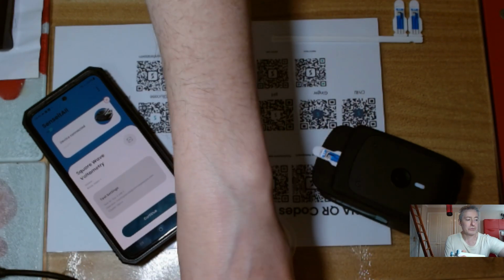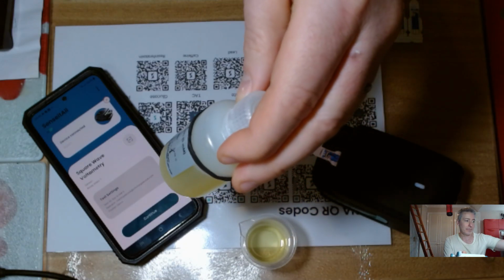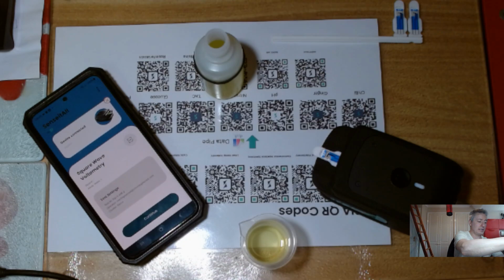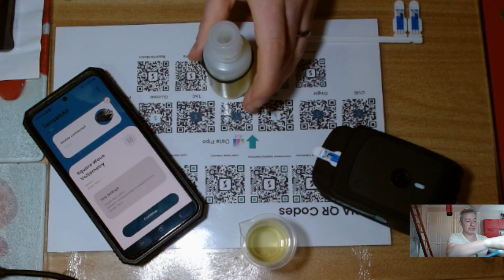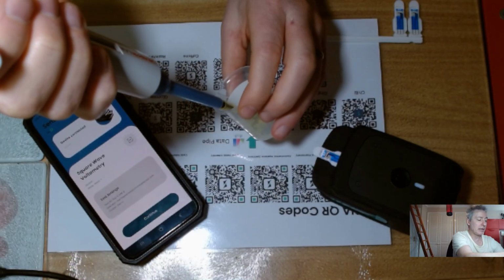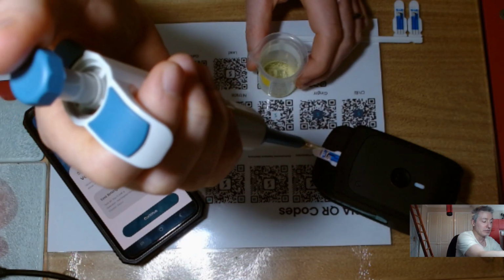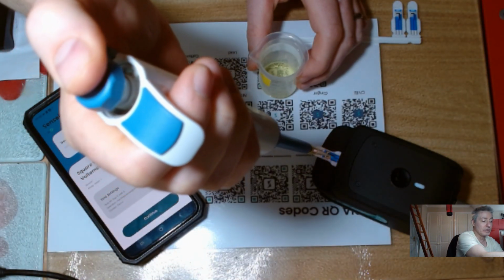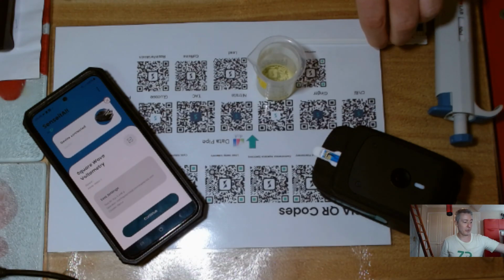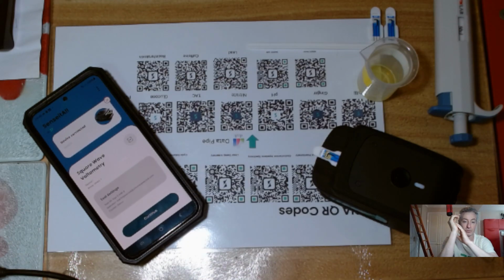So the first thing I'm going to do is grab some of this reagent from ZP. So this is a ferricyanide solution. I've got it already decanted. I'll just put 50 microliters onto the sensor. The first thing I like about electrochemistry, and especially the way that we do electrochemistry, is that we haven't optimized this, but this is only a 50 microliter drop. So it's a great science for doing point of care, point of need diagnostics because the sample size is quite small.